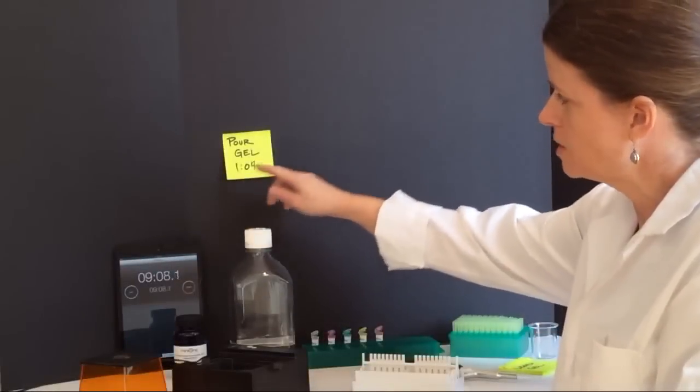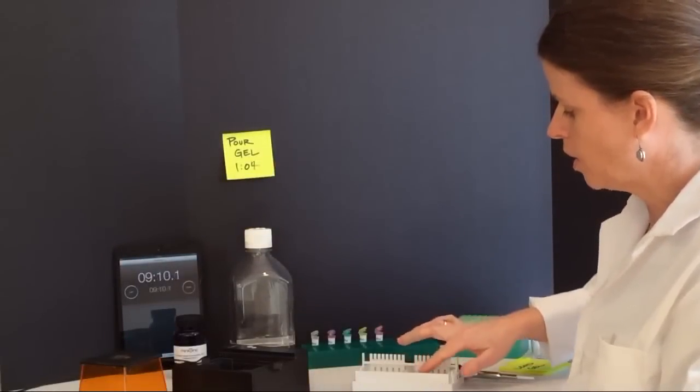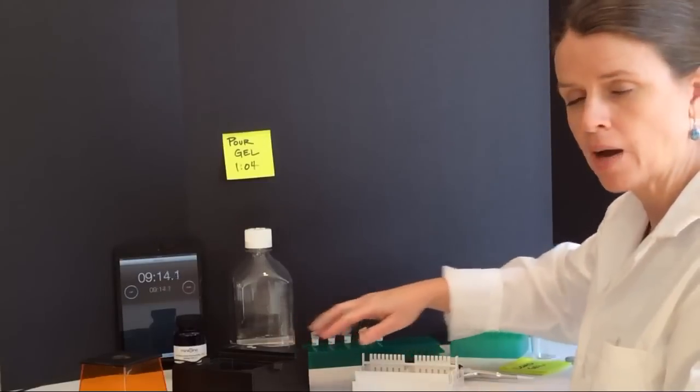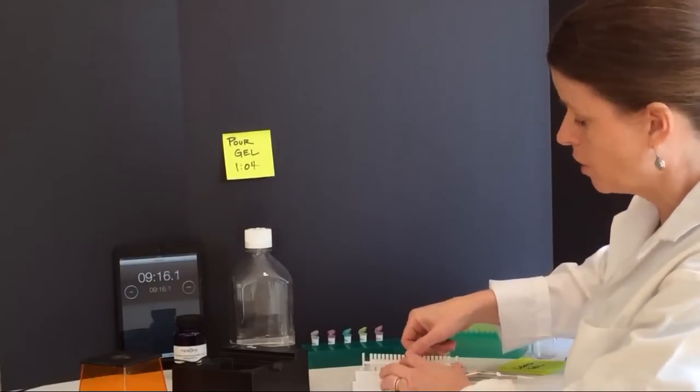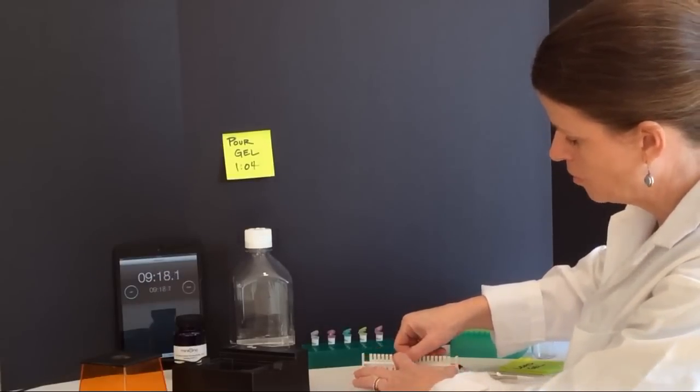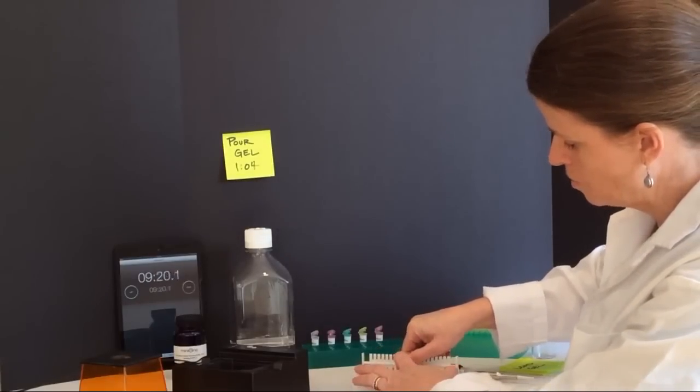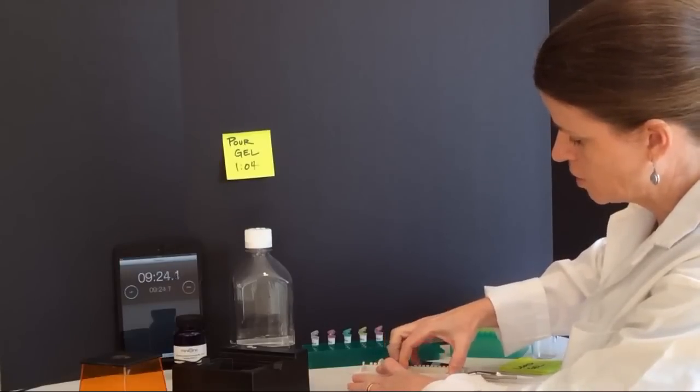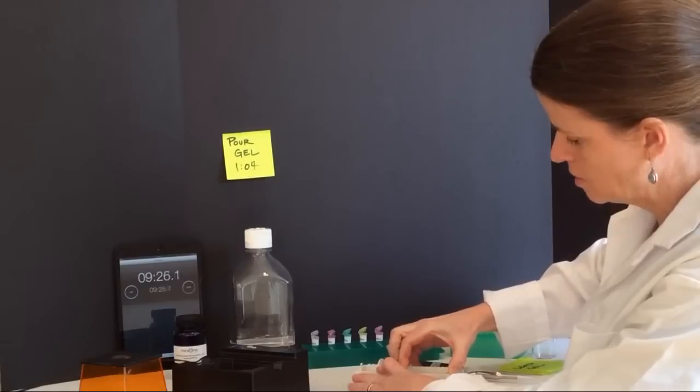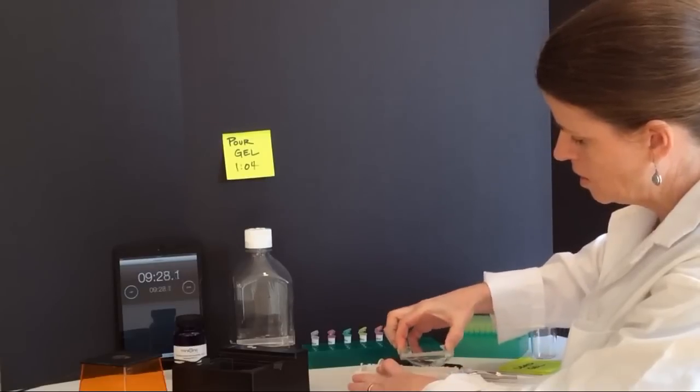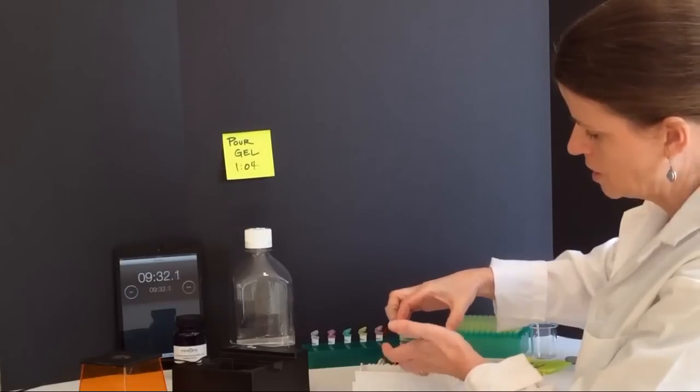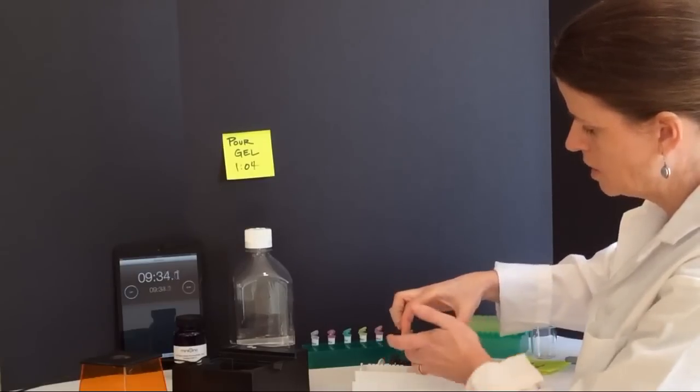It's been about 8 minutes since we've poured our gel and our gel is solidified and we're ready to actually begin to set up our apparatus and load our gel. I'm going to simply remove our comb and then lift our gel tray out of the casting tray. Sometimes you'll notice a little of the gel will go underneath the tray and I can just simply peel that off and dispose of that.